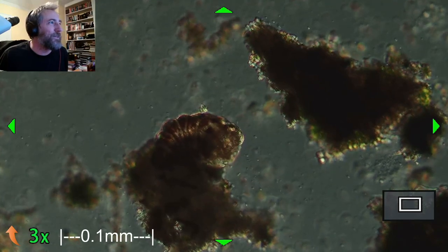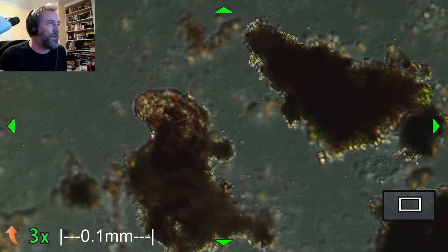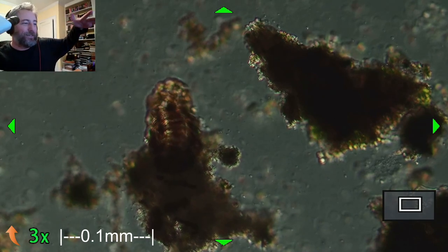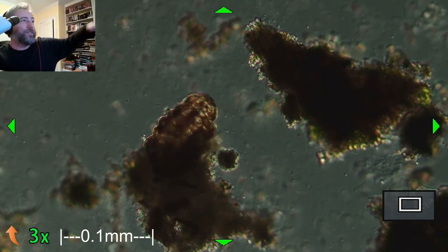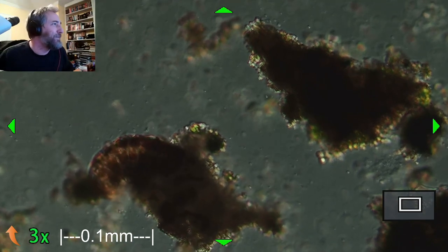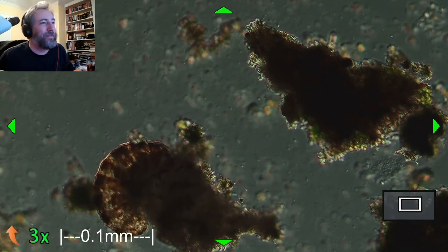I looked at some samples earlier today. These are from some sticks that I collected in my driveway, and also some sticks that were on the roof of my house. Our bedroom has the porch roof, which is really flat, and I can just stick half my body out the window and grab some sticks. So I did that, and then I collected some more from the driveway.